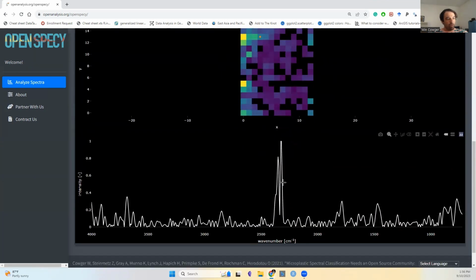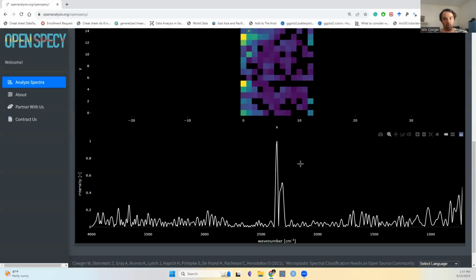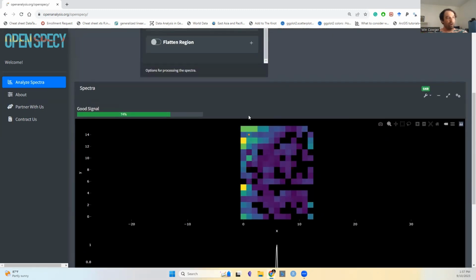Right. So in this spectrum, I talked about this in some of the other tutorials too. There is a CO2 peak that's being a pain. It is causing my background, so these are background spectra, there's like a gold slide behind a particle, it's causing them to look like they have really high signal to noise, but actually they don't.